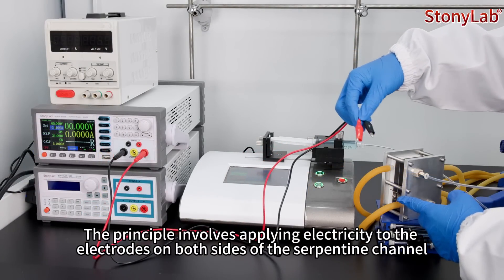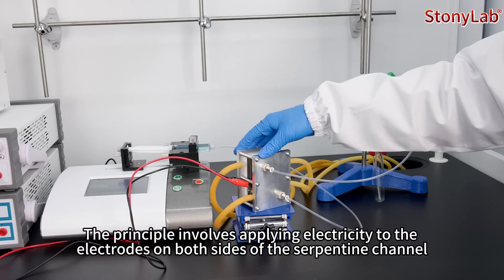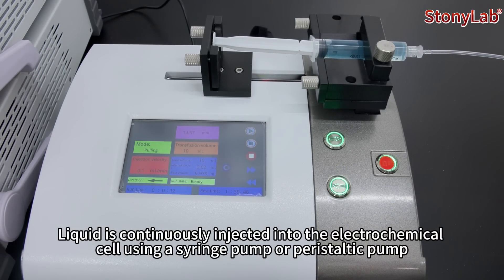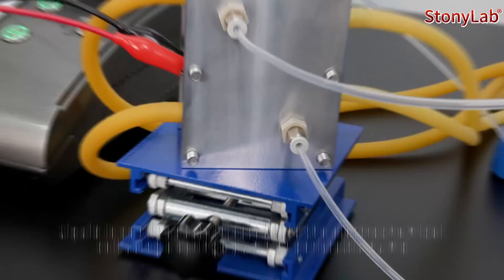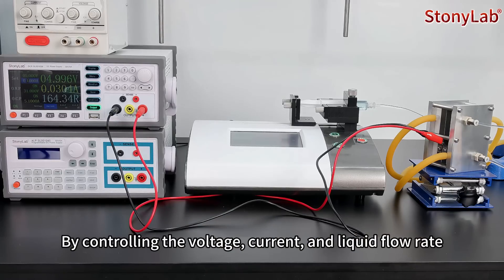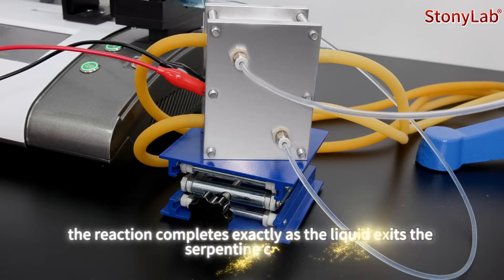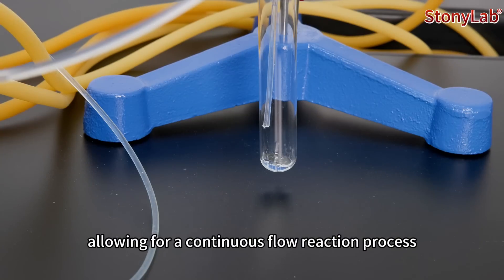The principle involves applying electricity to the electrode on both sides of the serpentine channel. Liquid is continuously injected into the electrochemical cell using a syringe pump or peristaltic pump. The reaction begins as the liquid enters the serpentine channel within the reaction chamber. By controlling the voltage, current, and liquid flow rate, the reaction completes exactly as the liquid exits the serpentine channel, allowing for a continuous flow reaction process.